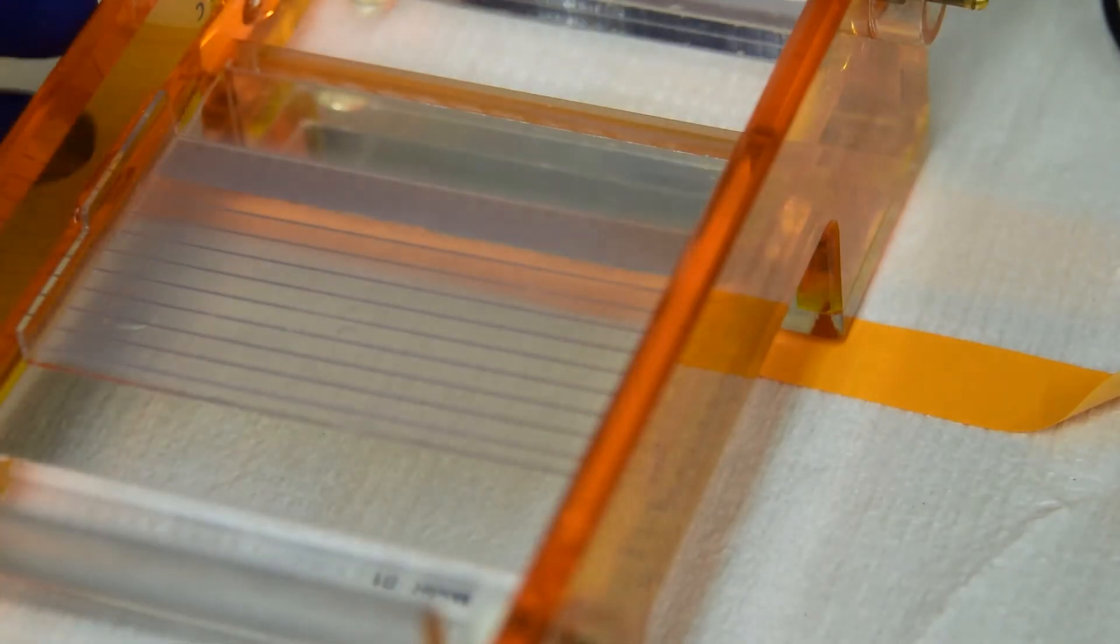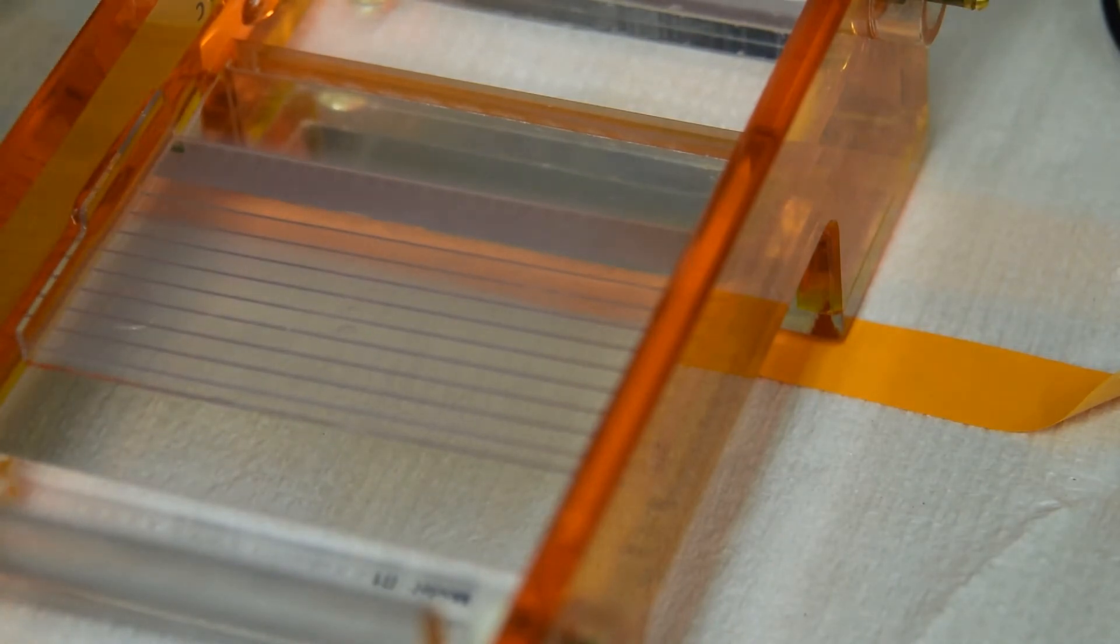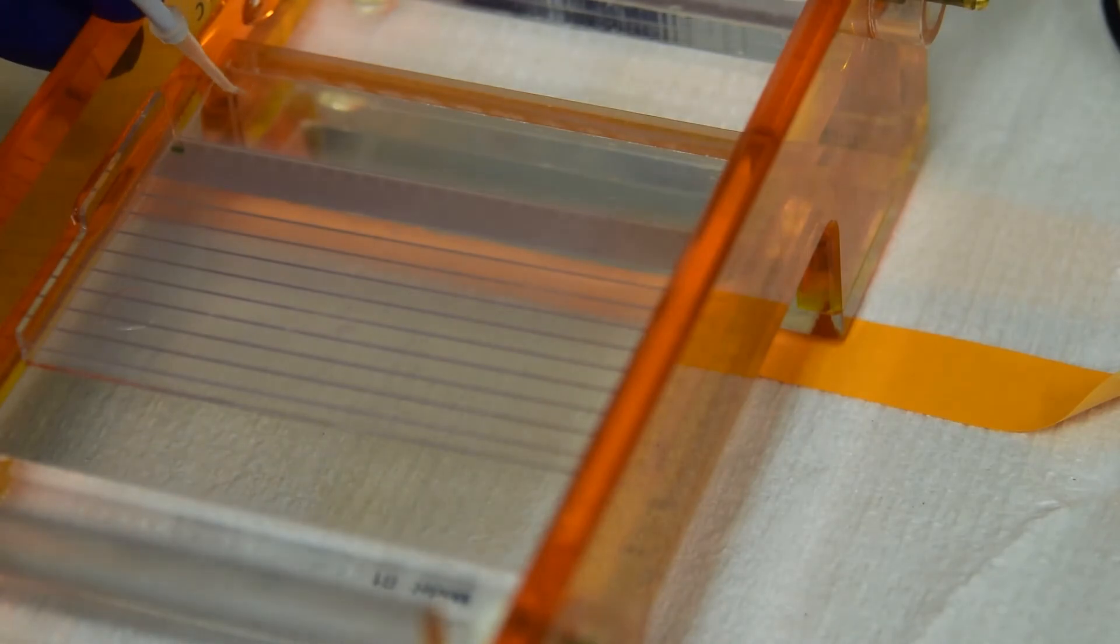Pipette each drop of PCR product into the wells, rinsing the tip between samples by pipetting up and down. You can stabilize the tip with your other hand.